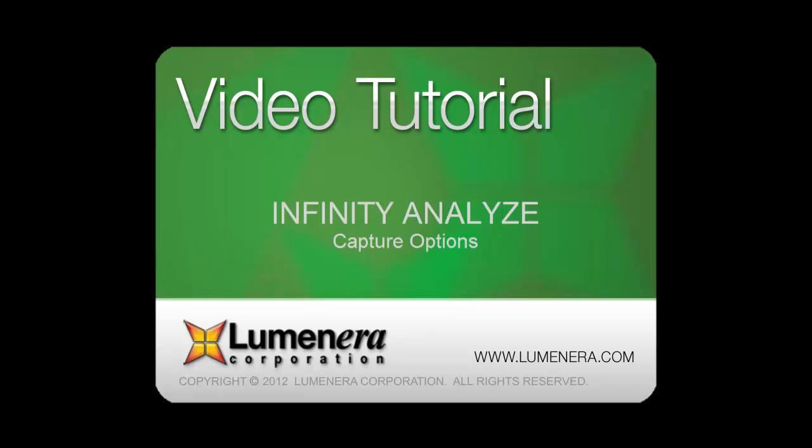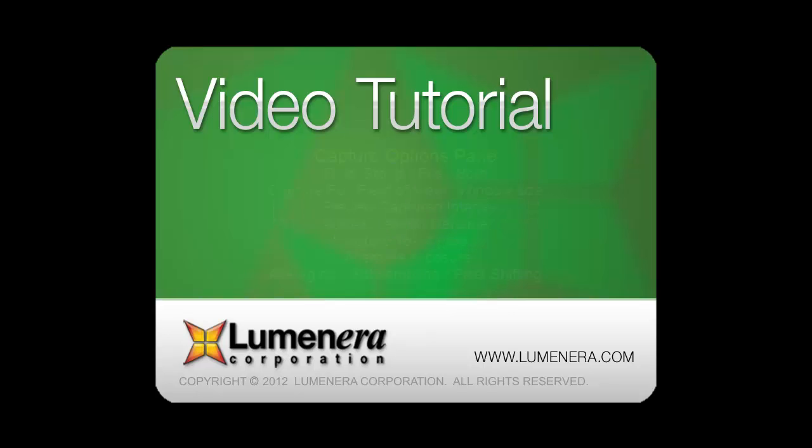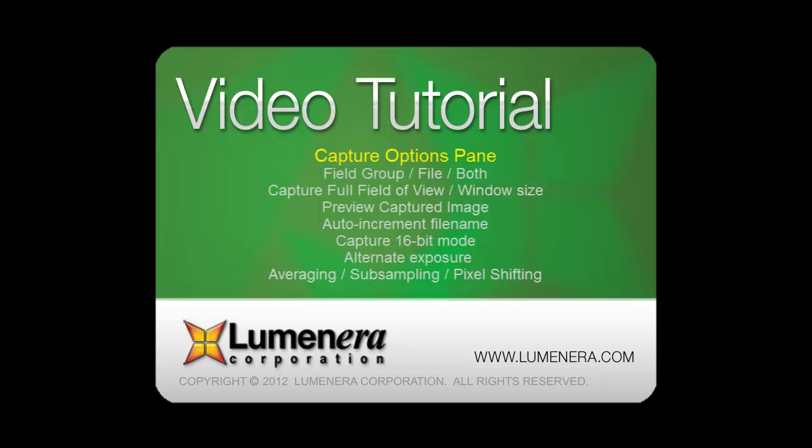In this tutorial we examine the various options provided for acquiring images from the camera, for storage to disk, or for further processing.